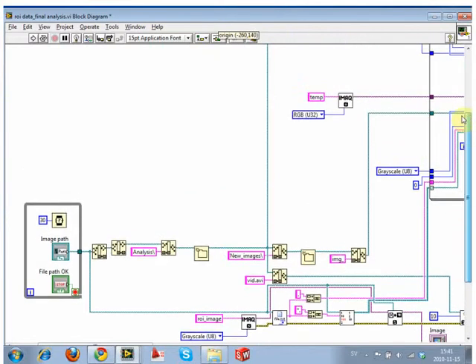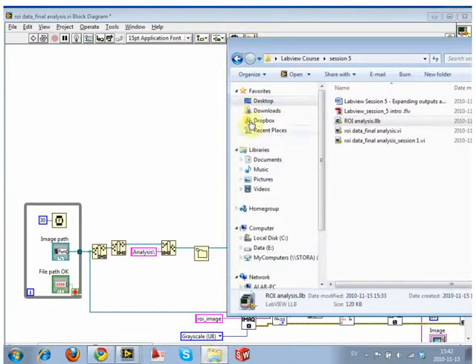Handling of the files is something that goes wrong a lot because it's so easy to make mistakes. Figuring out how to strip the path and what to put where, it's very common to make mistakes, and we've seen it in all of the sessions that inevitably things happen. So one thing that is nice to do is to build your own kind of hierarchy so that when you're actually doing your analysis, things don't just go into the same folder.